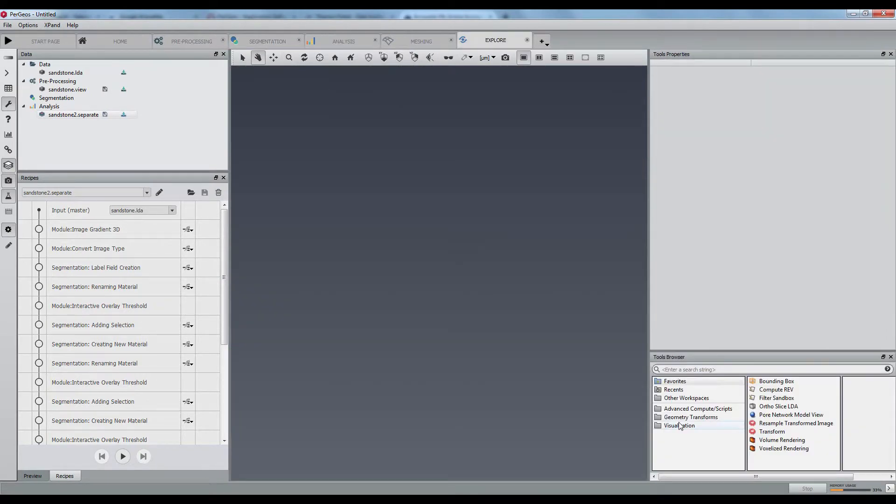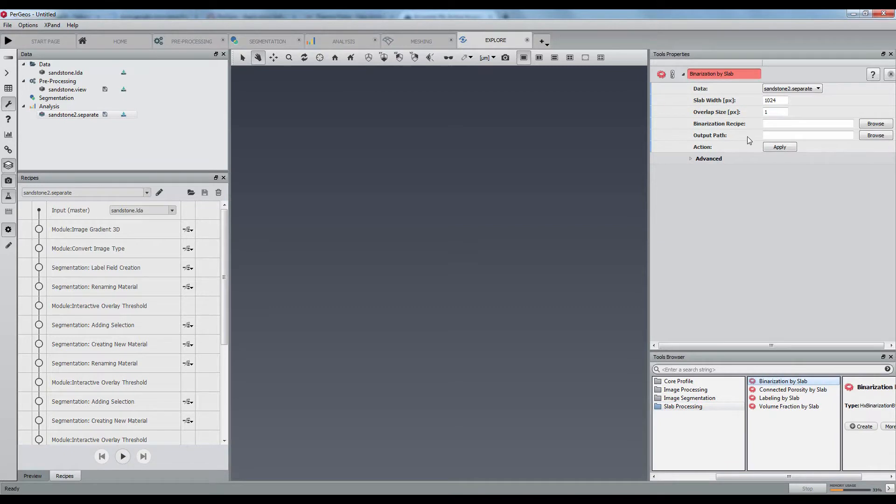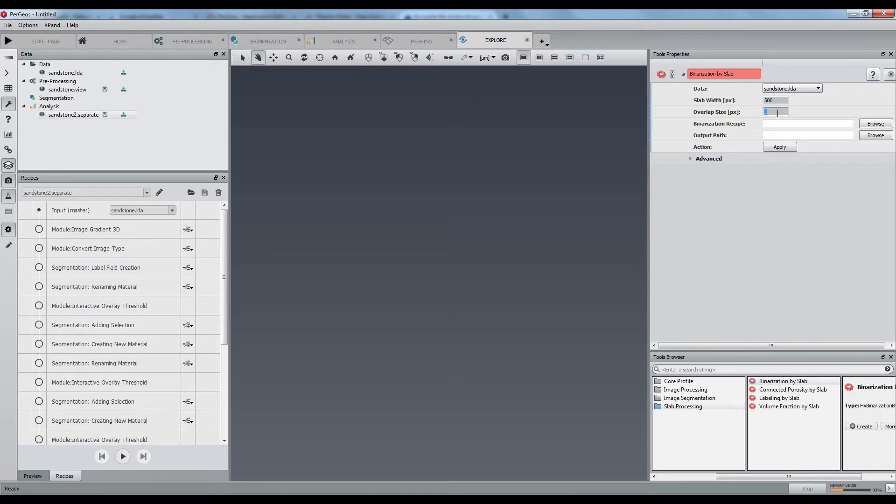In the Explore workspace, the Binarization by Slab module will be responsible to segment and separate the whole data with the saved recipe.